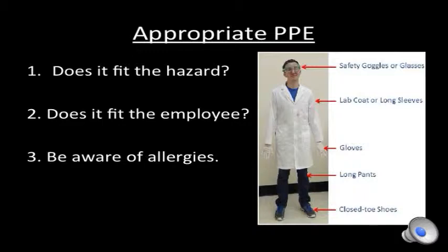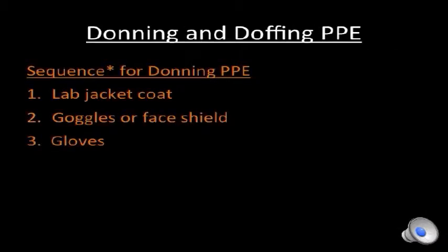Be sure that any PPE you obtain for your employees or yourself fits correctly. Baggy PPE can create a hazard by itself. PPE should be durable, fit snugly, and not interfere with the employee's movements. And finally, talk with your employees or employer and make sure all known allergies to PPE materials are documented and avoided.